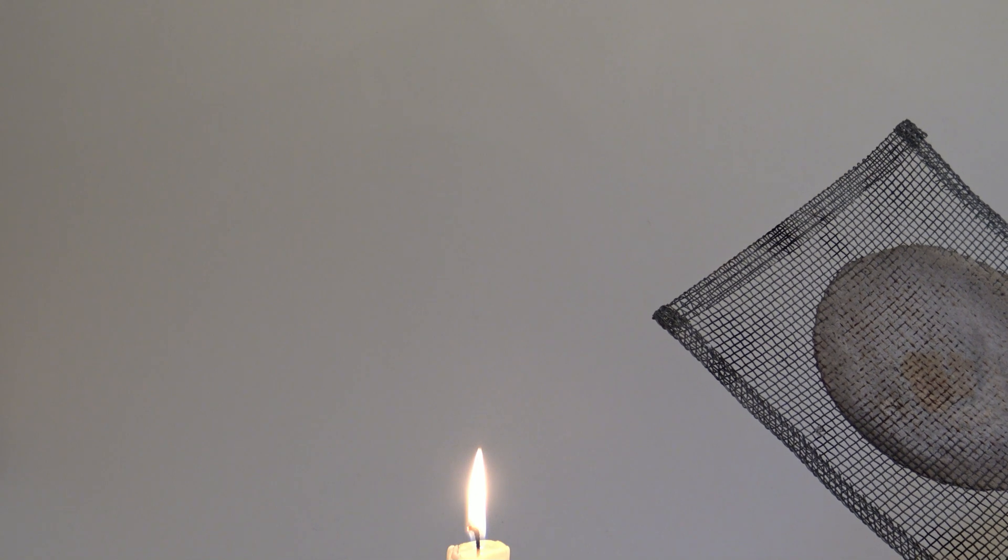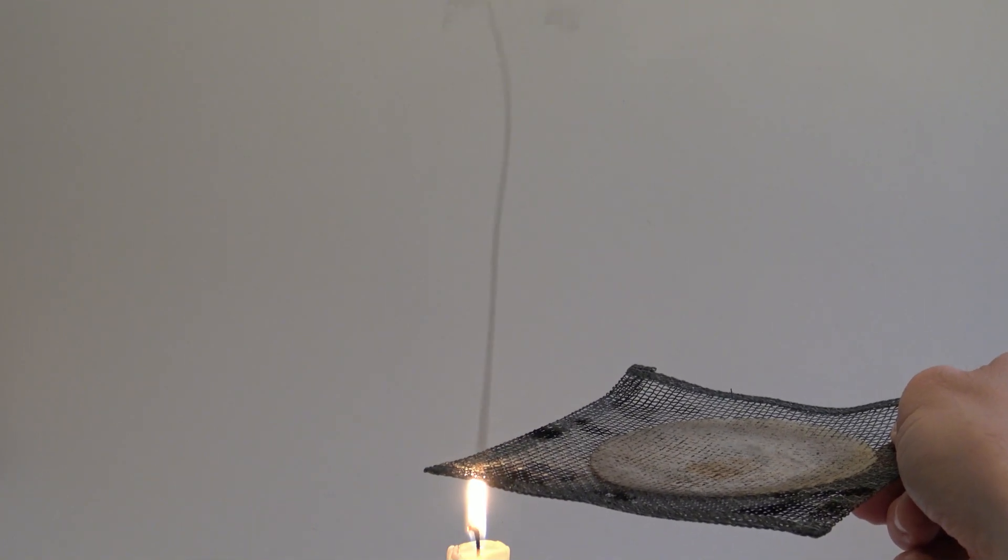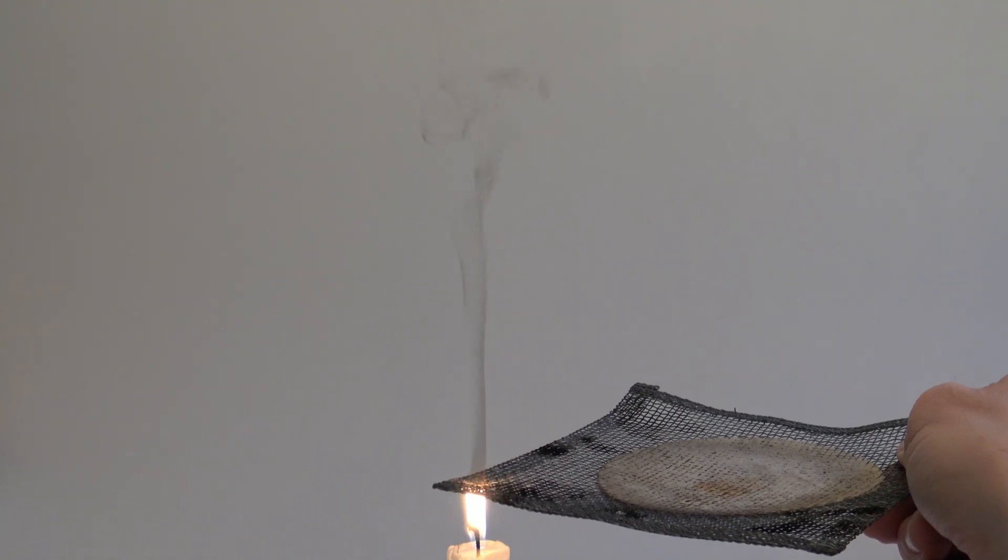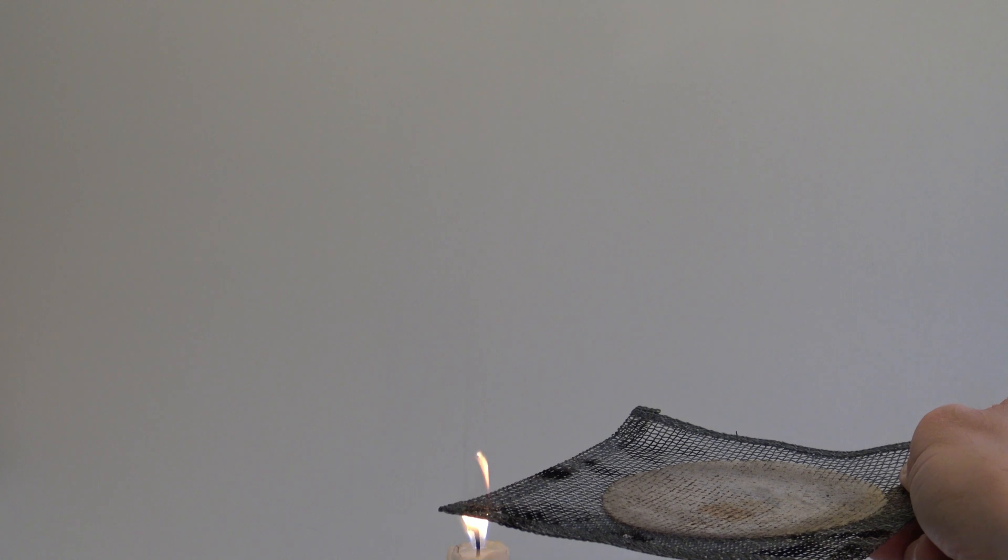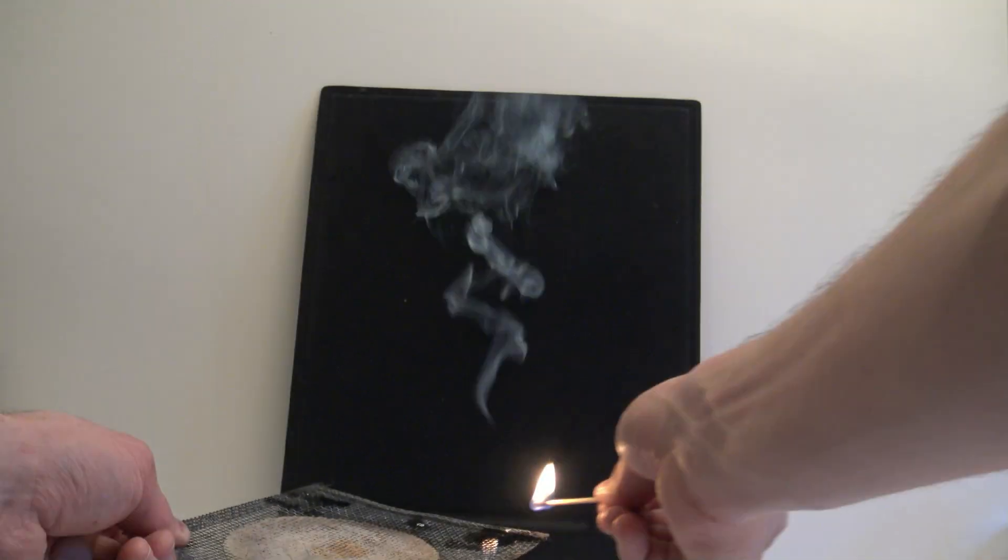To show that soot particles are formed in an incomplete combustion of the wax, a wire gauze can be held into the top of the flame. When it is held lower, the smoke becomes white as it is now wax vapors instead of soot particles. When the wire gauze is held at the right spot, the vapors can even be lit again.